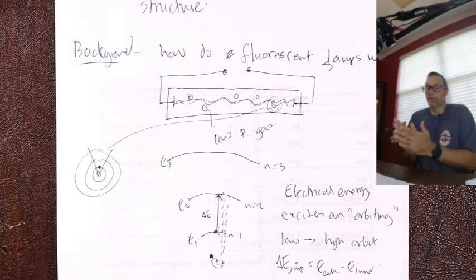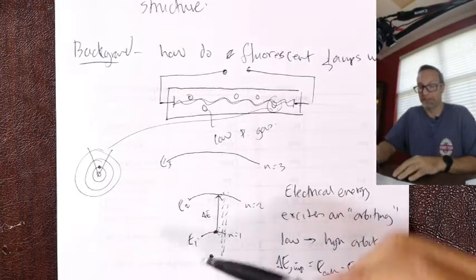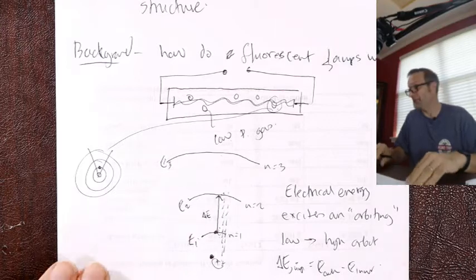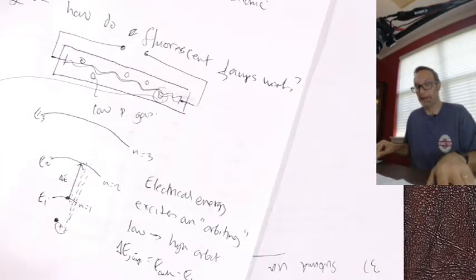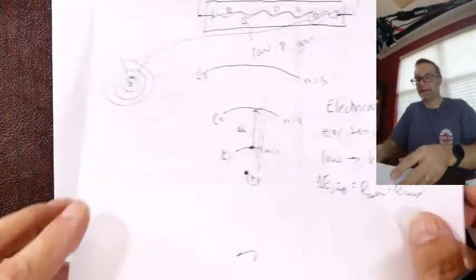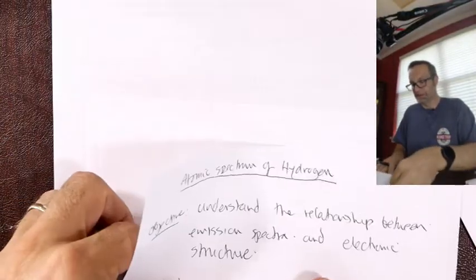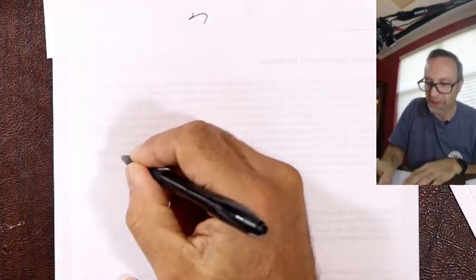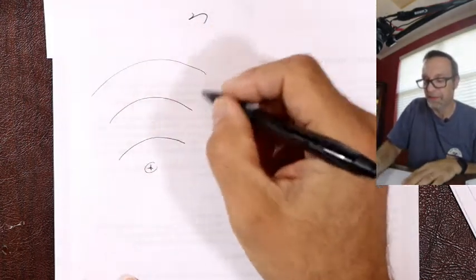Okay, fair enough. We can't measure that. We can't measure the distance on the way up, unfortunately, but good news is we can measure the distance on the way down. If I fold this over, what's that classic expression? What goes up must come down, right? So let's think about what we got. Layer 1, layer 2, layer 3.